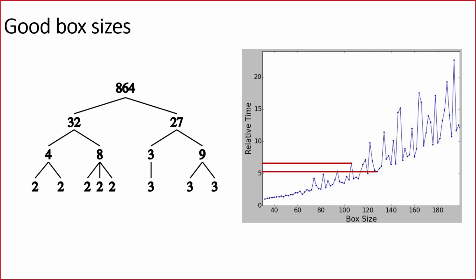So here we can see our nice box size of 128 that has a processing time of around 5 minutes. And here we have the 106 that we talked about, a smaller box, which should indicate that our data processing should proceed faster and take less computational time, yet it takes more than 5 minutes.